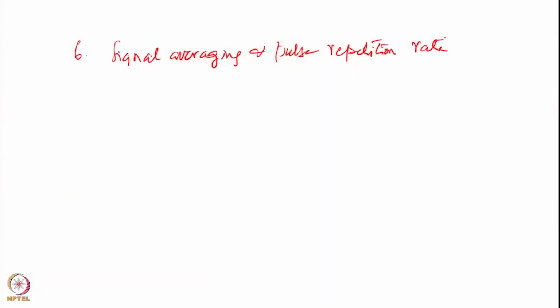Okay. The next point, so what is signal averaging? Let me draw that schematically here.